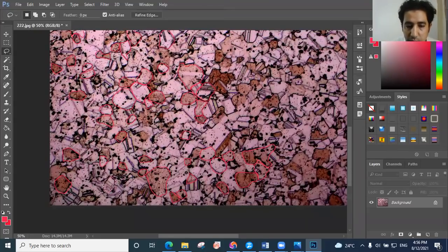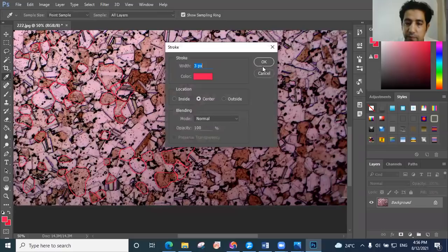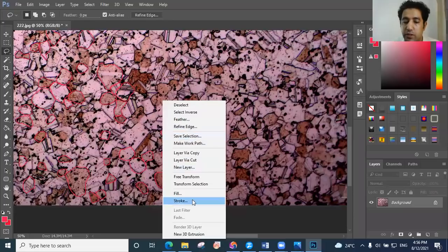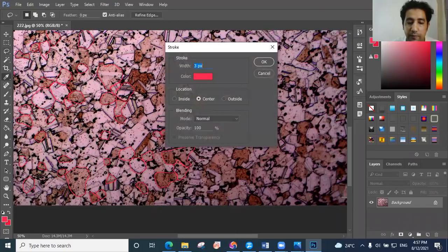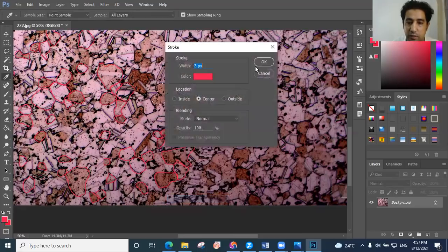Here, some grains are not clear, just leave them and go to another side and find the clearer one. Some grains are growing abnormally, so just go and find the normal grain. Here could be one grain and these are just twins.